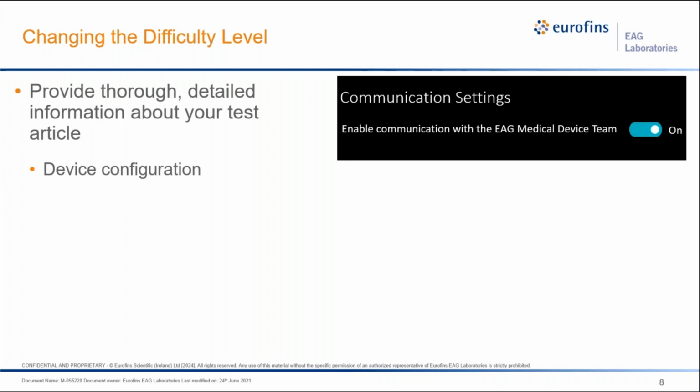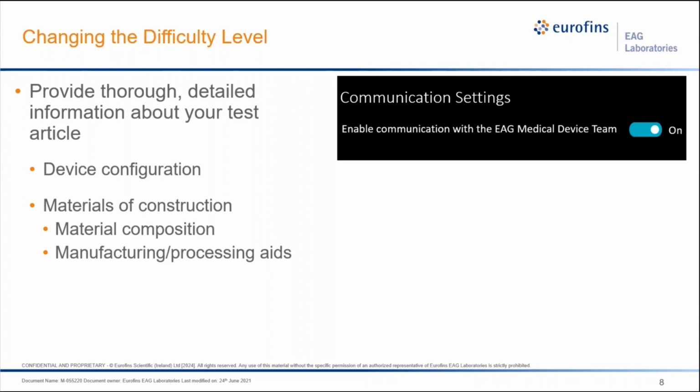How are the raw materials processed? What chemicals are used during these processes? Examples include initiators, antioxidants, surfactants, lubricants, or other additives that might be left over from the manufacturing process. And finally, how is the device packaged, stored, or shipped? A device may be pristine before it's in the package, but species such as slip agents can and do transfer by the time the device makes it to our lab.